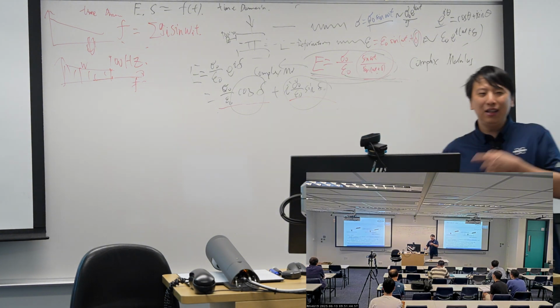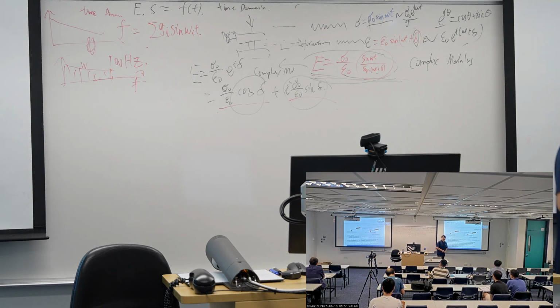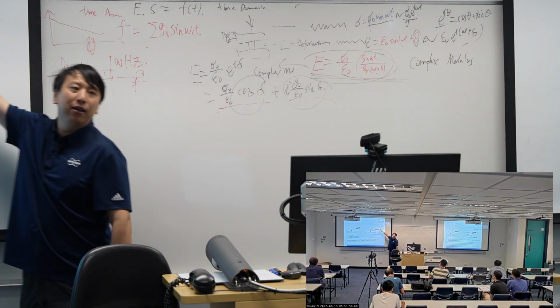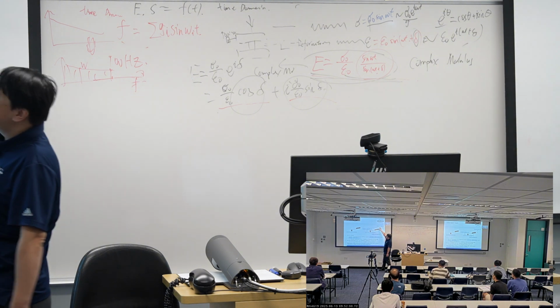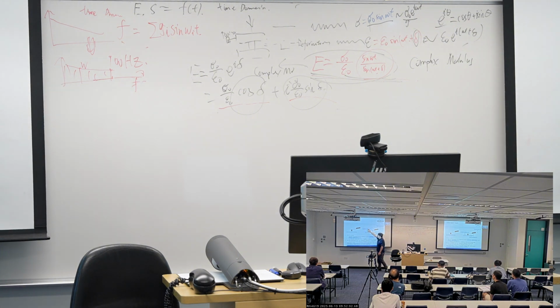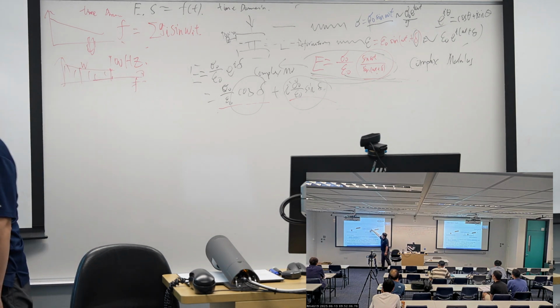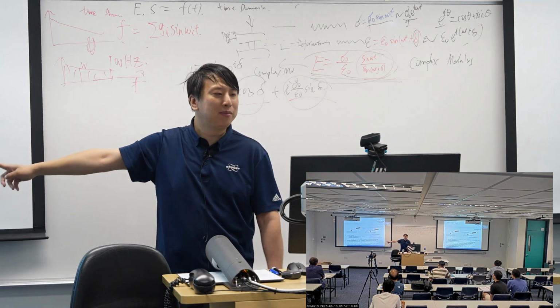and for the AFM, the story is a little bit different. As Dr. Ma said yesterday, we cannot measure deformation directly. We are measuring the scanner movement Z, and we need to measure the deflection. And from the difference of them, we get the deformation or indentation, which is the same.